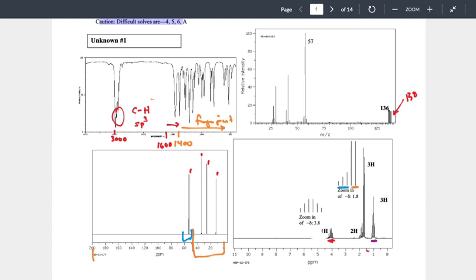That hydrogen is bonded to something. Could that be anything? It's a bit of a mixed bag of yes and no. It should attach to the carbon that is attached to the bromine, because of the chemical formula. We have a chemical formula that says we have carbon, hydrogen, and bromine. The hydrogen cannot be connected to bromine because then the structure is done, which means the hydrogen must be connected to carbon. If you want to bring that information in here, I'm okay with that.